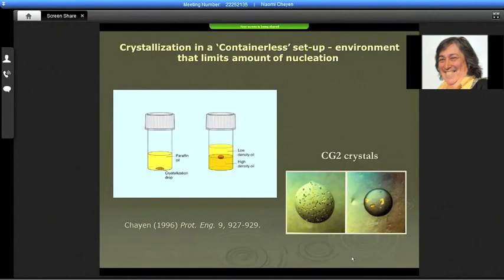Now here is a bit of a fun experiment with oils, because I was saying about nucleation that one wants to create environments with a bit less nucleation. And of course we know that chemists, for example, make a scratch in a dish in order for it to act as a nucleant. But often you don't want too much of it. Here you see on your left two little vials, one with a microbatch experiment with a drop just under oil, and on your right a drop between two oils of different densities.